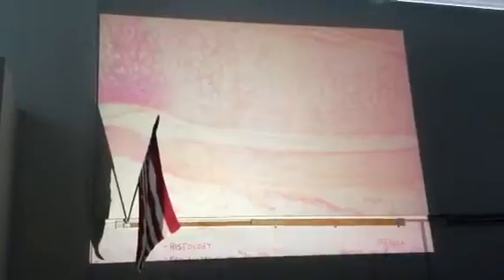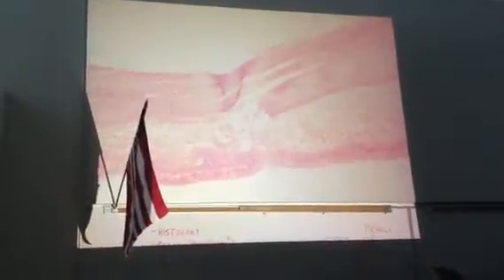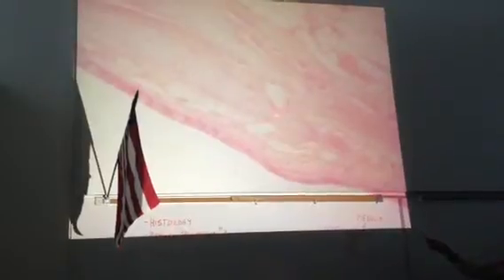And it doesn't matter which way we go, because, as I said, it's going to go up just like this, so we'll just go up on this side. The cartilage ends right there, and then we have the trachealis muscle, smooth muscle, connected to the cartilage over on this side.